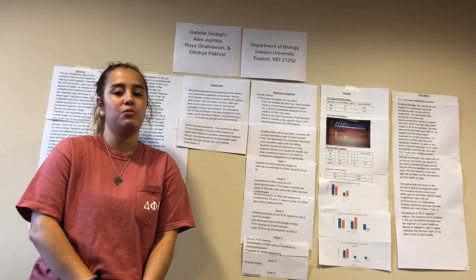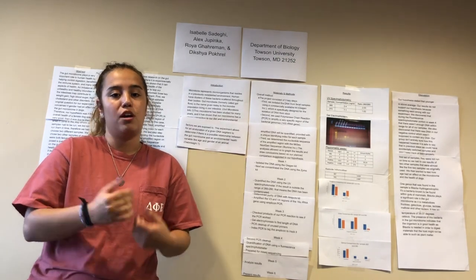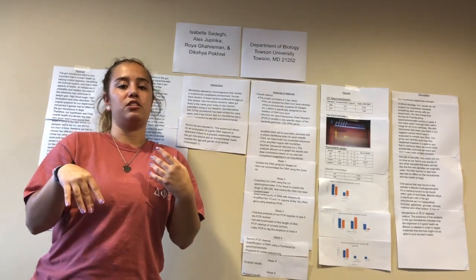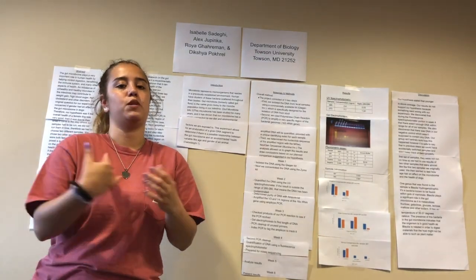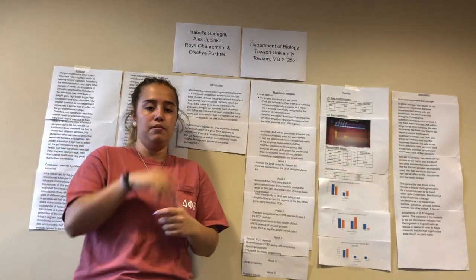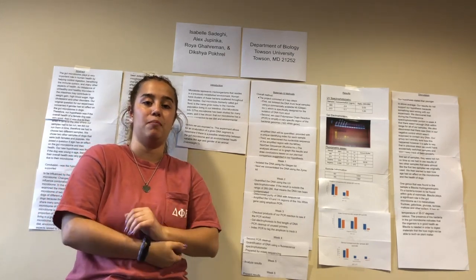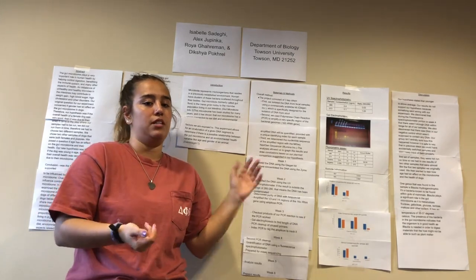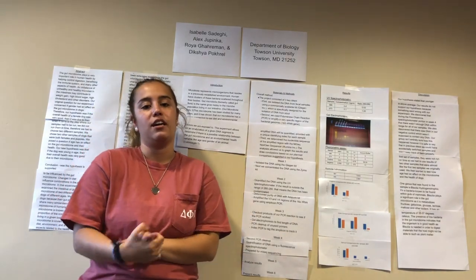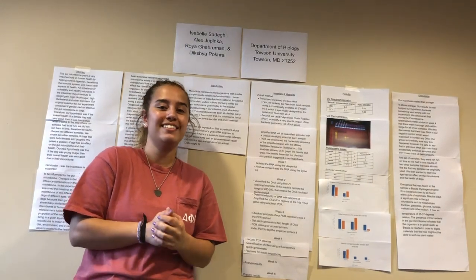So our question was to analyze the gut microbiome of 2 dogs around the age of 10 months or younger of different genders to see whether females had a better gut microbiome than males, which made us hypothesize that female dogs might have had a better gut microbiome. But our data did not support our hypothesis because our results were skewed and our DNA concentration was too low to gather adequate results to support or deny our hypothesis.